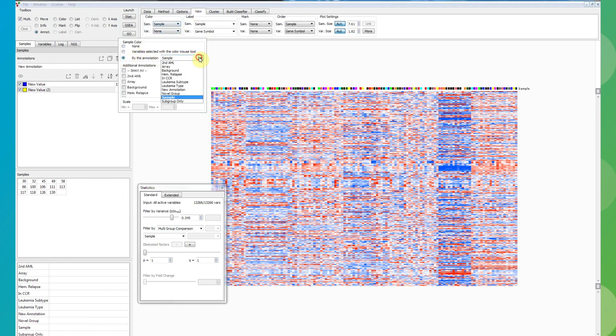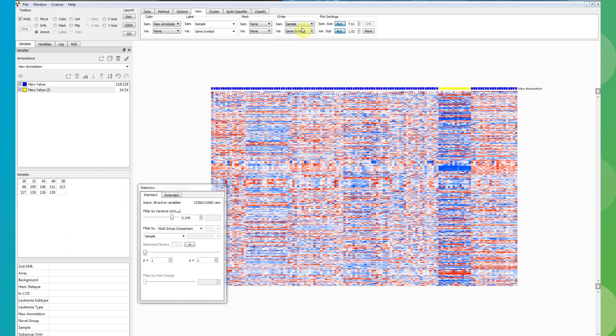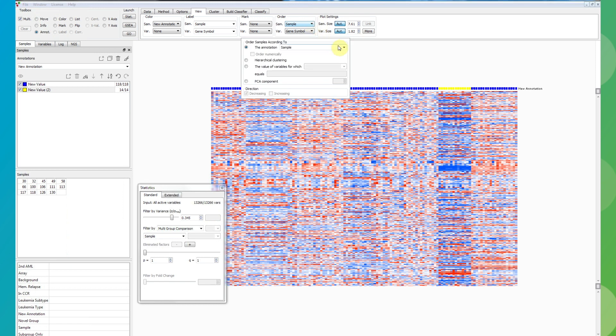Thanks to the visual approach and fast and easy filter options, ClucorOmics Explorer facilitates the exploration of your datasets.